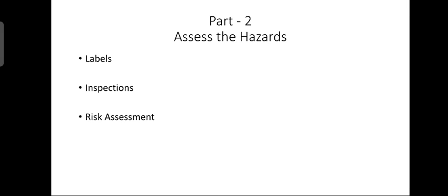Hello everyone. Today let me start part 2 of laboratory reagents, that is, assess the hazards. Now this assessing the hazards consists of three subdivisions: labels, inspections and risk assessment.